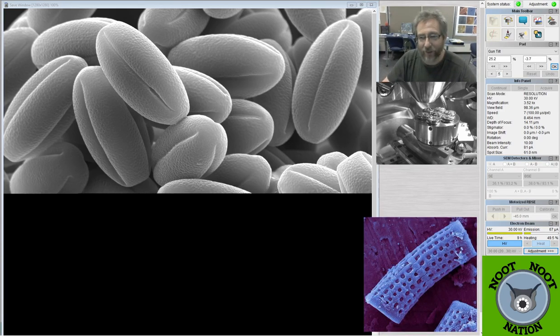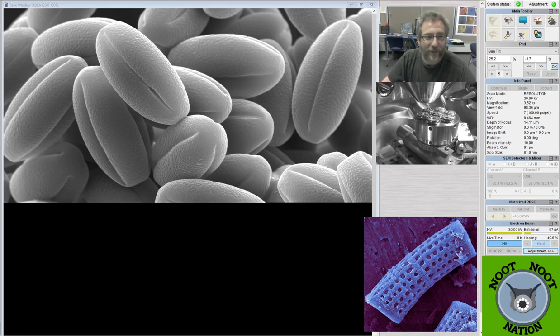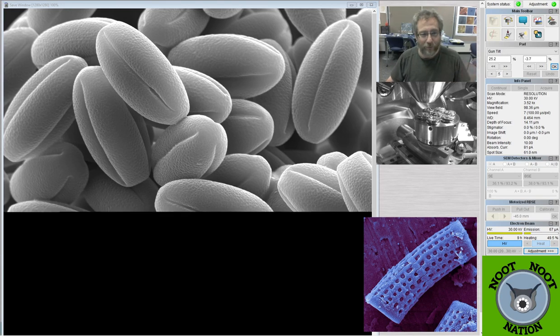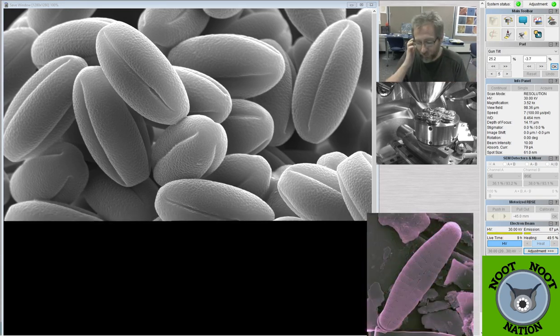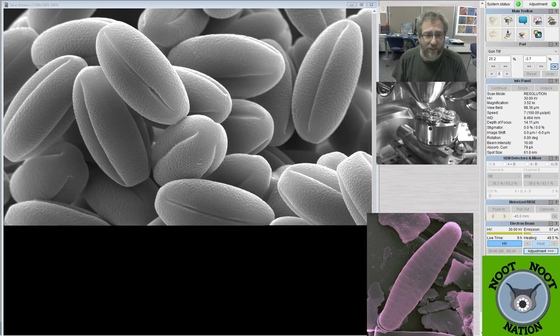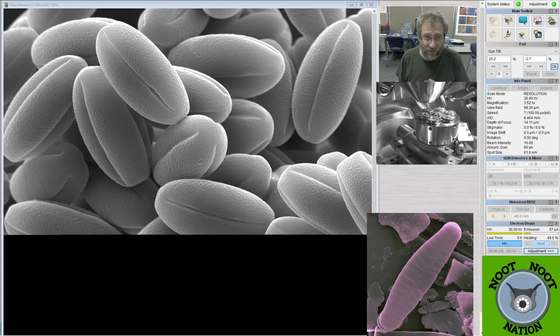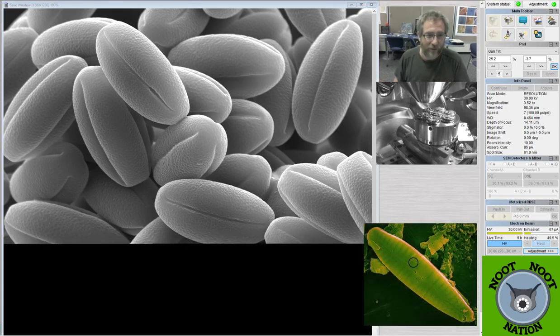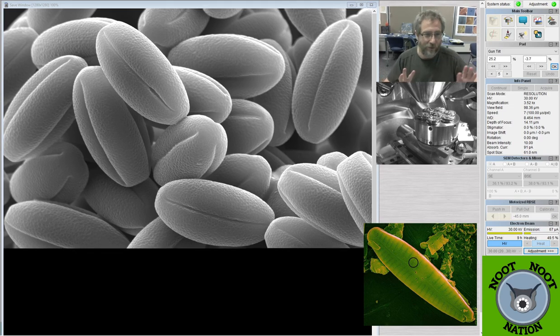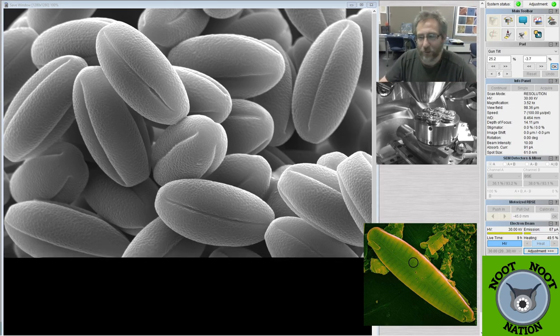One caveat to that, a pine pollen just looks like Mickey Mouse. It's easy to tell. One caveat to that, which is pollen is transferable from one plant to another, either through the wind or through insects. And so you can get transference that would potentially put the wrong kind of pollen on the plant. So you have to be careful. What I'm trying to do is just capture the most abundant type, which I assume is probably the one that the plant's actually producing, right?